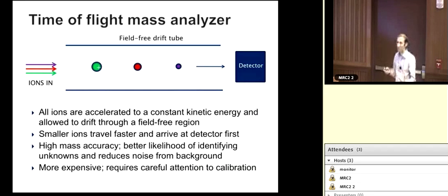you would be drastically underestimating. So why are we using mass spec for quantitation, and why do you guys claim that you can do quantitation? Well, there's ways around ion suppression that actually work quite well, and that make it so that in spite of this problem, which we need to be aware of, mass spec is actually very effective for quantitation. And so the first thing is to avoid adding components that can cause it.